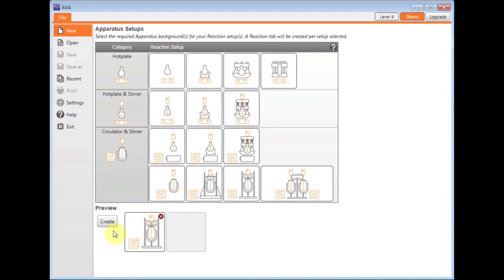I can also control multiple parallel equipment by setting them up from this window here. So I could choose, for example, two Reactor Readies and control them within two different tabs. In this example, I'm just going to control the one Reactor Ready.